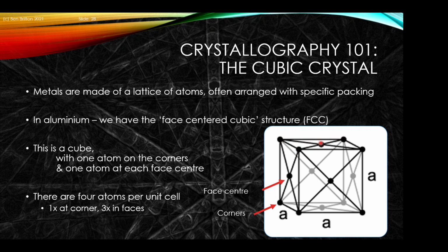So we can consider effectively the neighborhood of each atom, or the number of atoms that are present in that cube. Specifically, the unit cell describes the smallest tessellating object, something that can be shifted in space. In that tessellating object there is one atom at the corner, or you can consider there are 8 corner sites. There is an eighth of an atom described per tessellating unit cell.